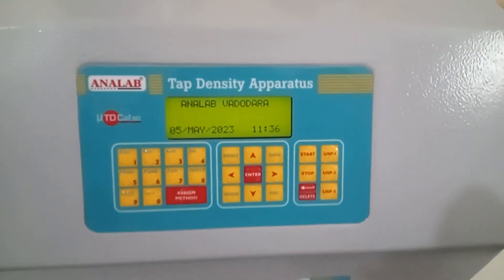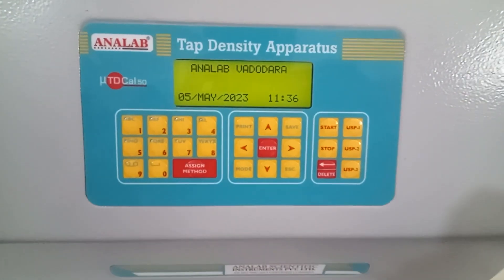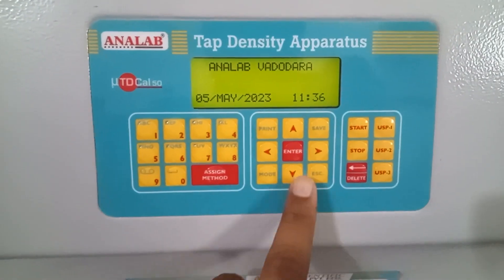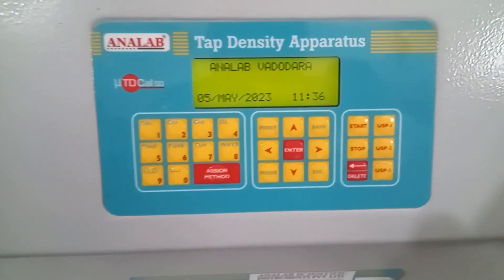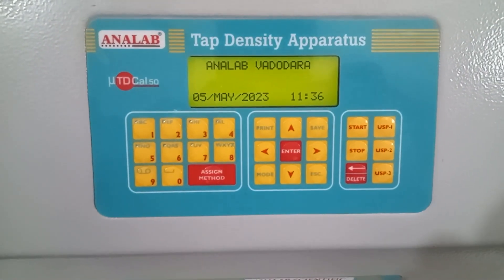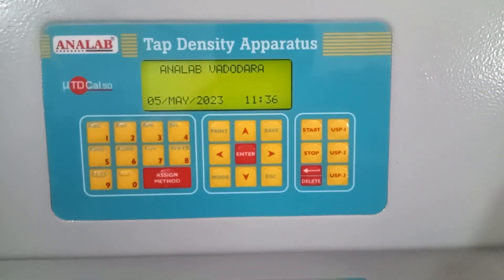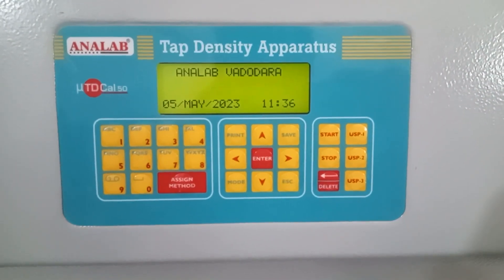Now let's check the overview of the keypad. This is a basic alphanumeric keypad which is almost self-explanatory. These are the other command functions for print, save, mode, escape, and so on. These are the shortcut keys which will be used to run the instrument, which we will discuss further in the video.